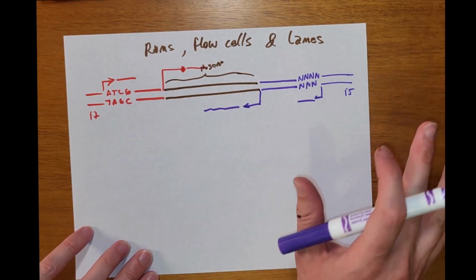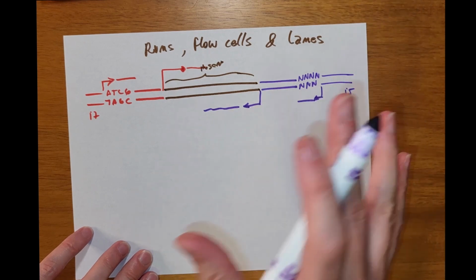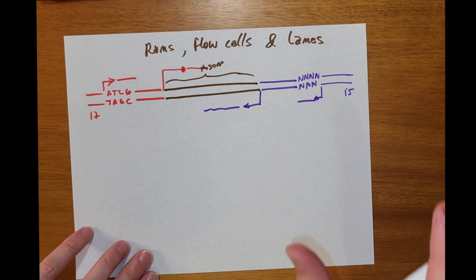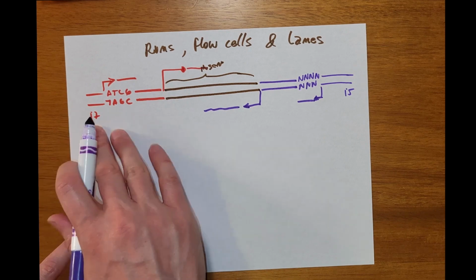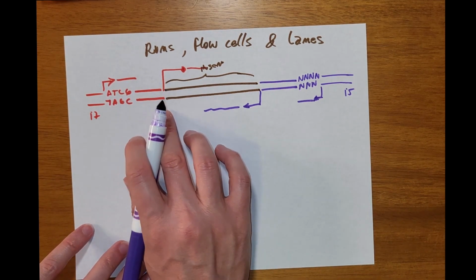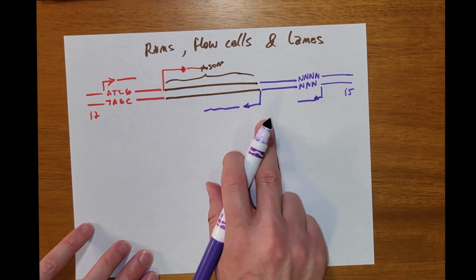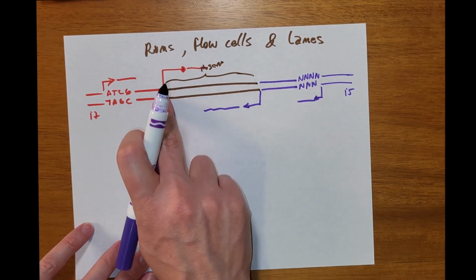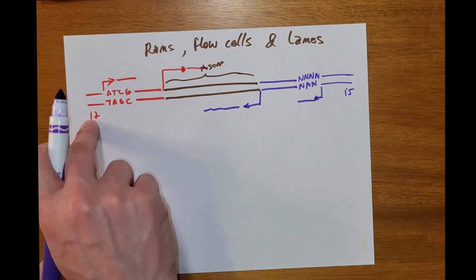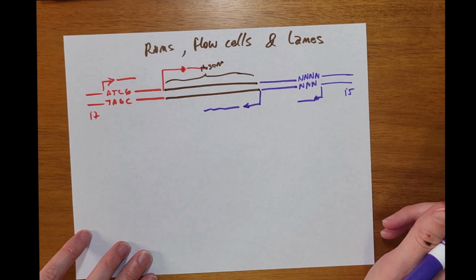So that's flexibility that you have, and you just need to tell, okay, I have my barcode or my unique molecule identifier within the I5 or I7 primer, and then also you will need to tell, depending on your read, you may want to do single end, paired end. If you do single end, you will need to tell, okay, sequence from the I7 primer or the I5 primer. So you do have all that flexibility.